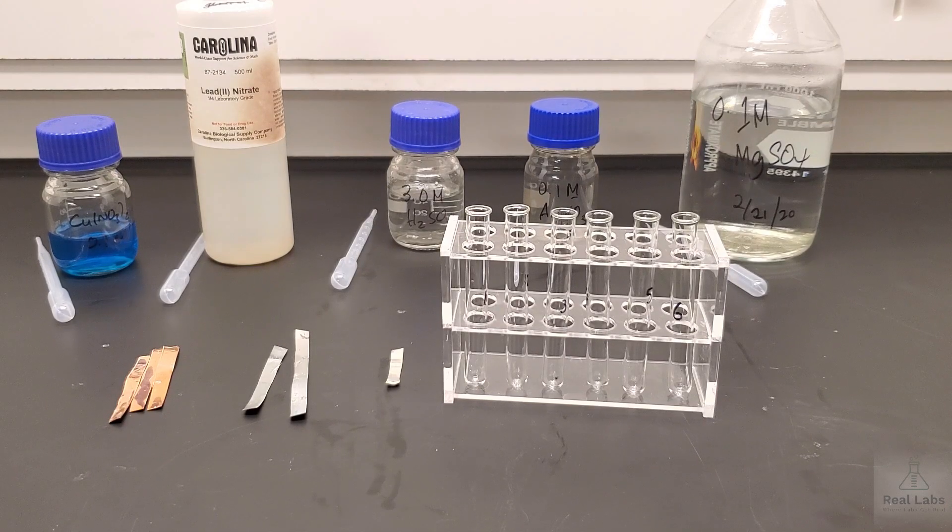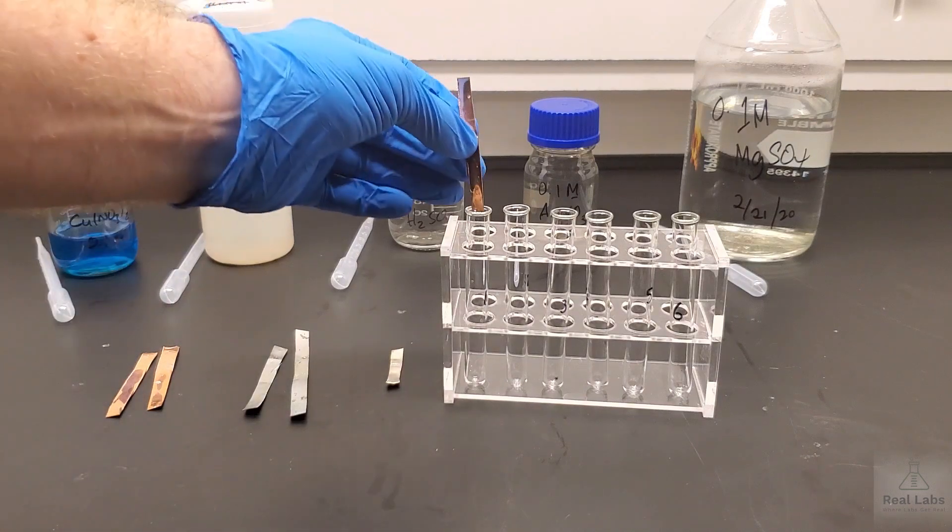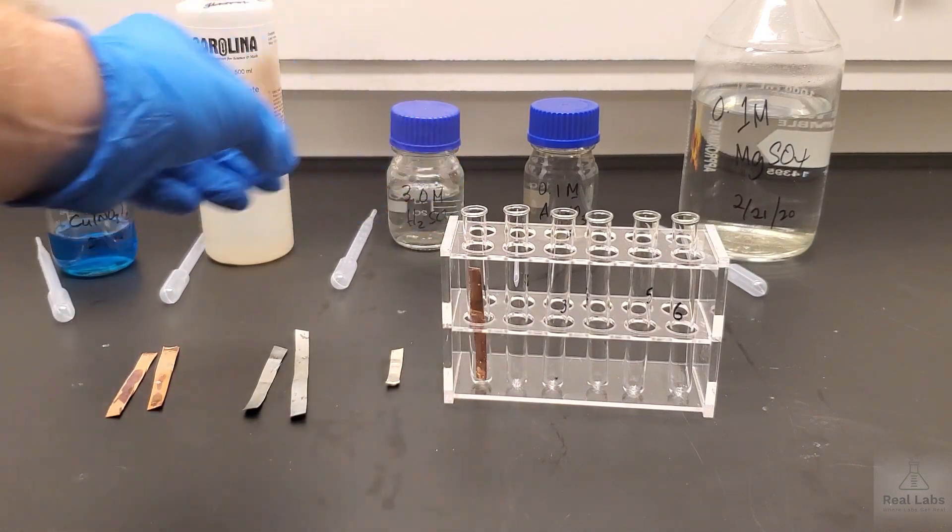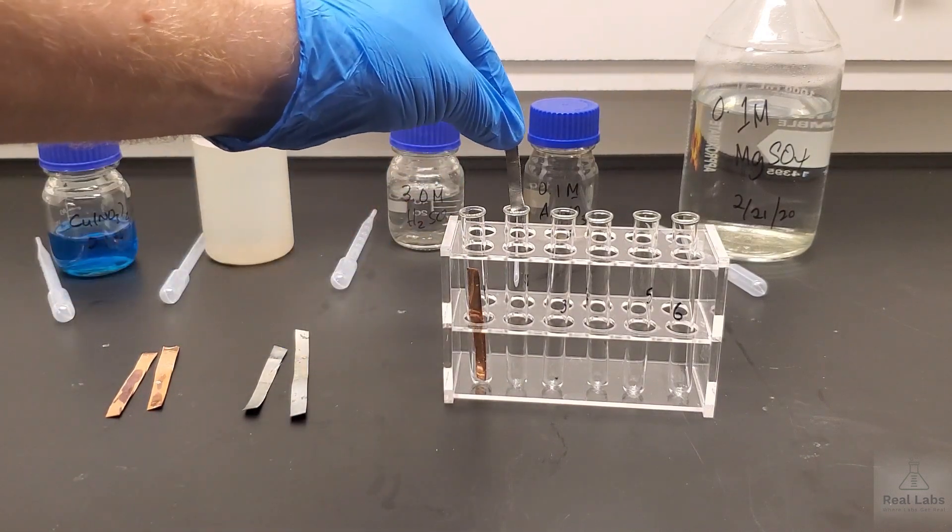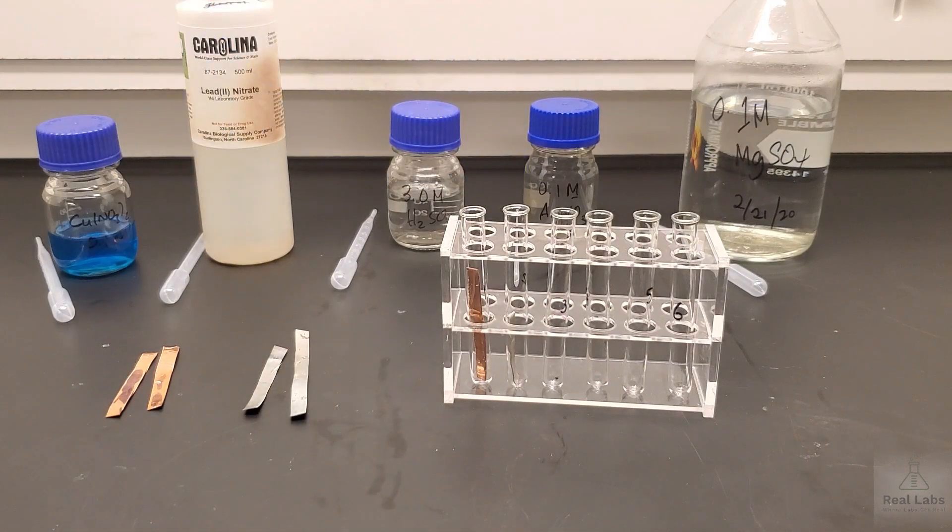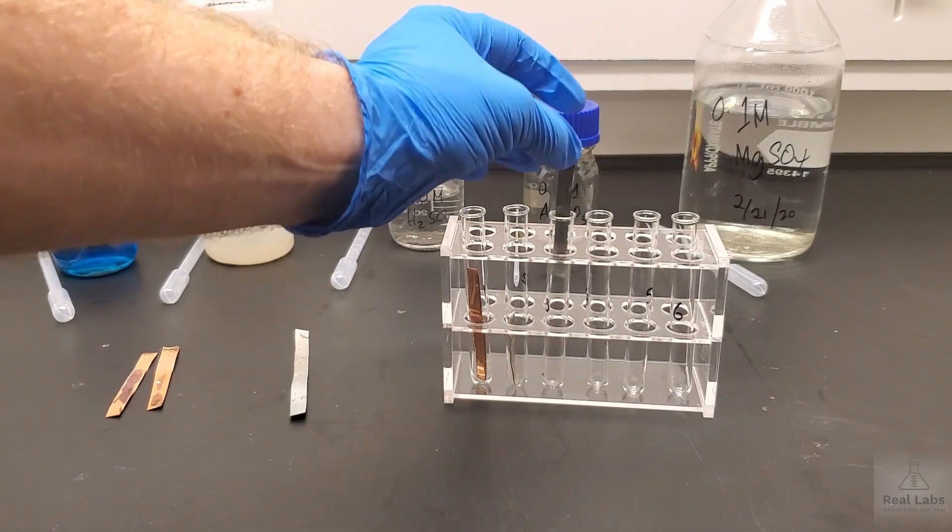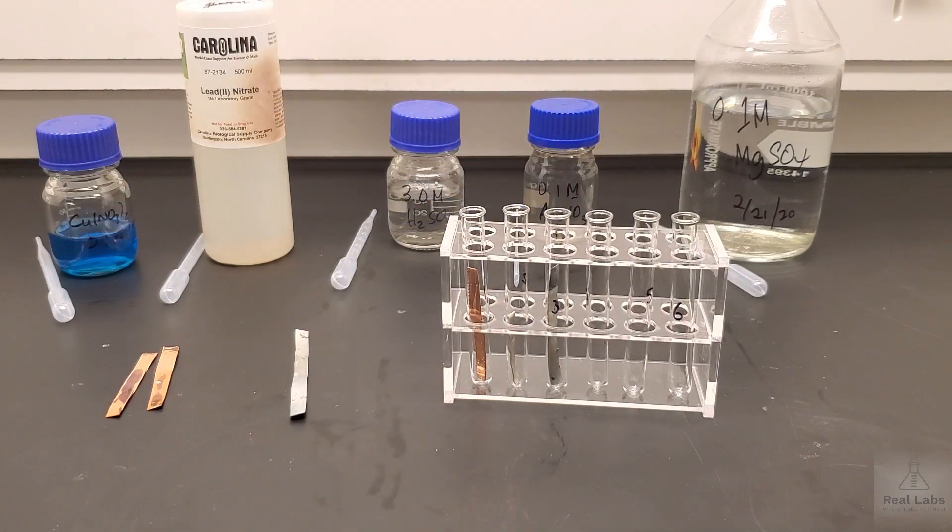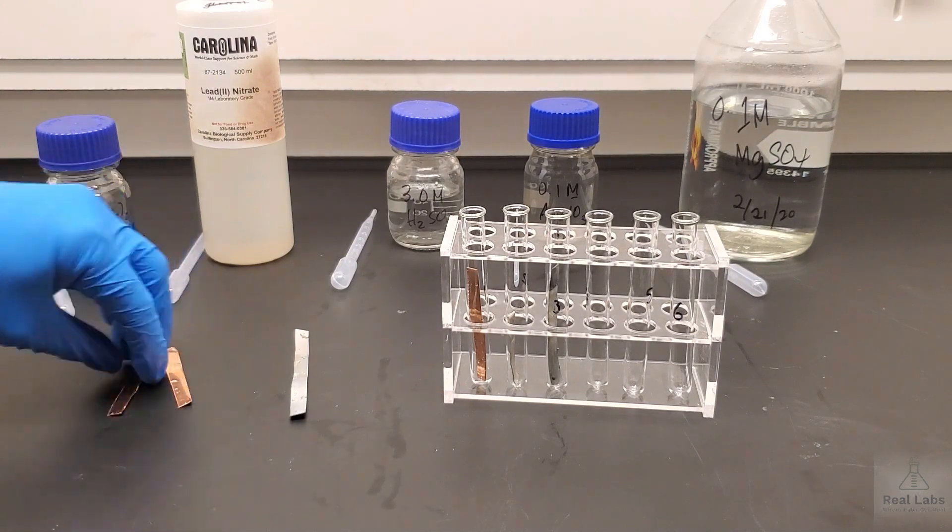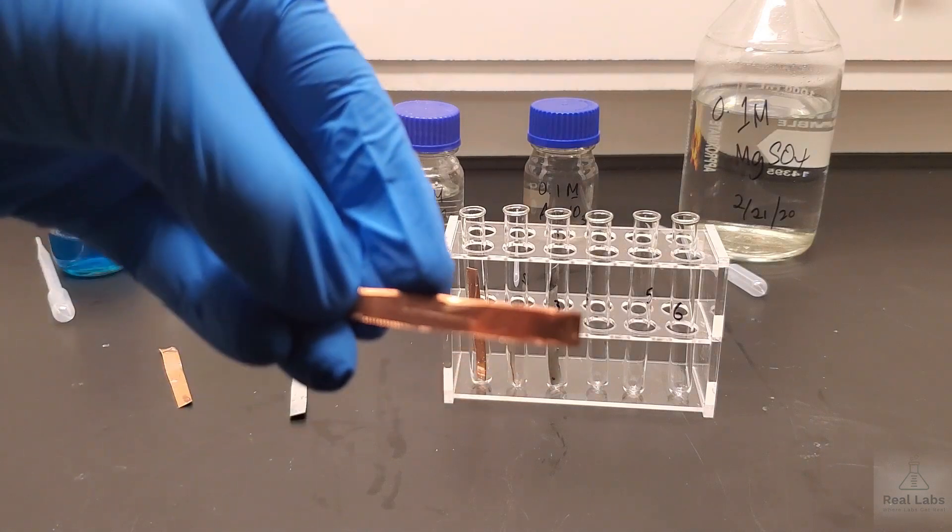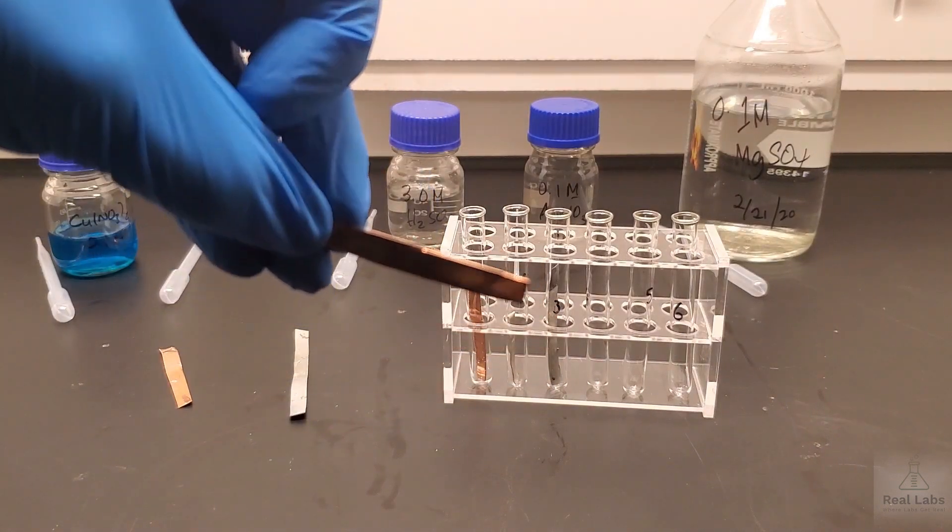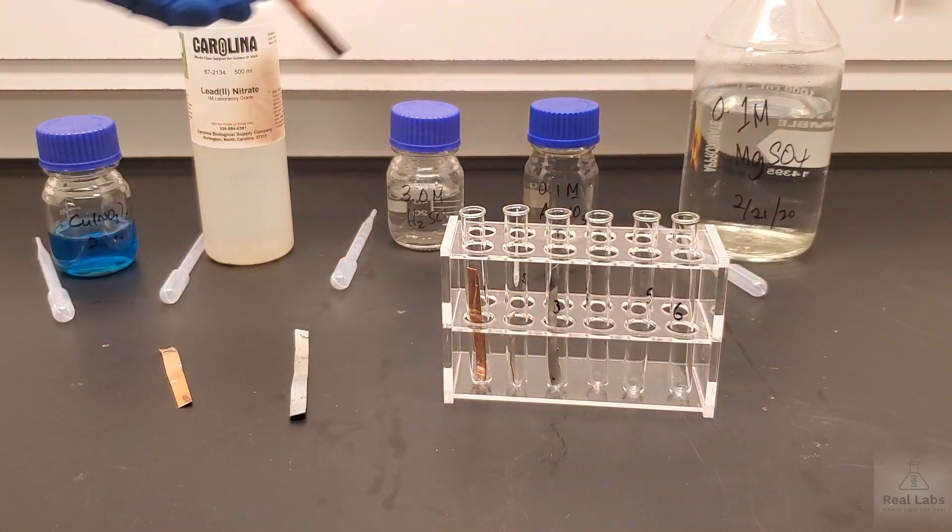In the first test tube, we're going to add a copper strip. Into the second test tube, we're going to add our lead strip. Into our third one, we're going to put a zinc strip. Just so you know, the ends of these I've already buffed out and polished up a little bit, to make sure they're nice and clean so that if a reaction does occur, it occurs very readily. For example, if you look at the end of this copper strip, it is pretty shiny.